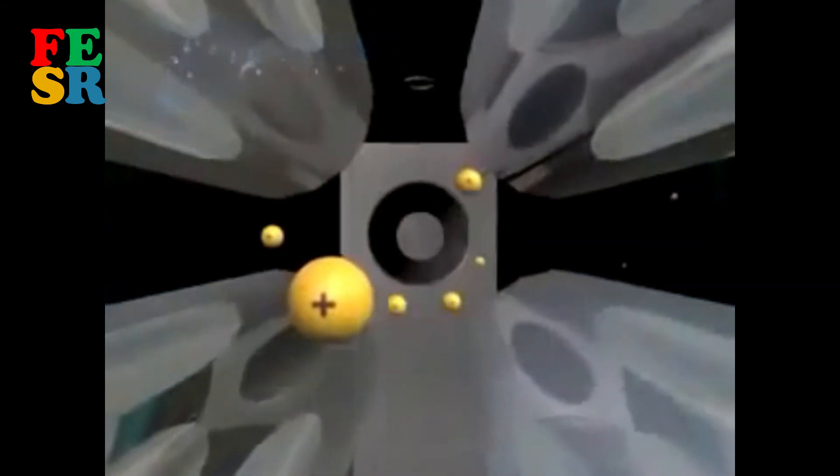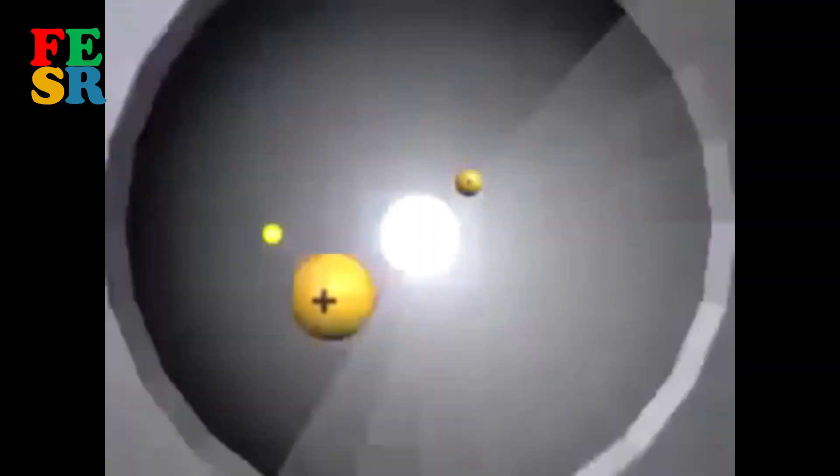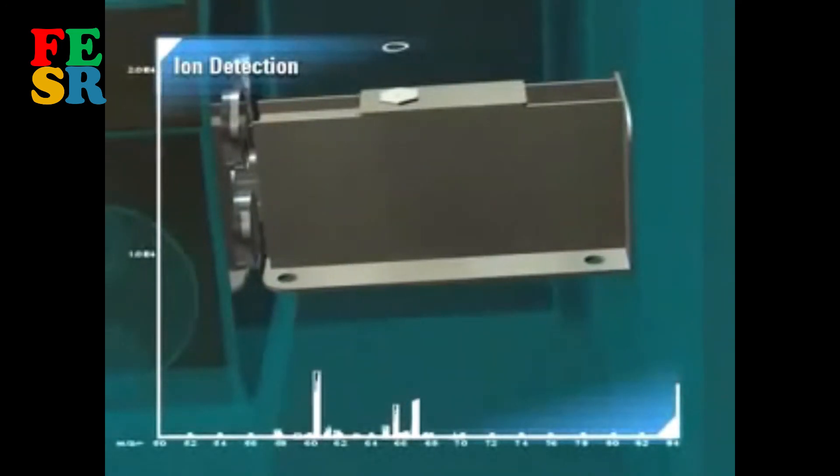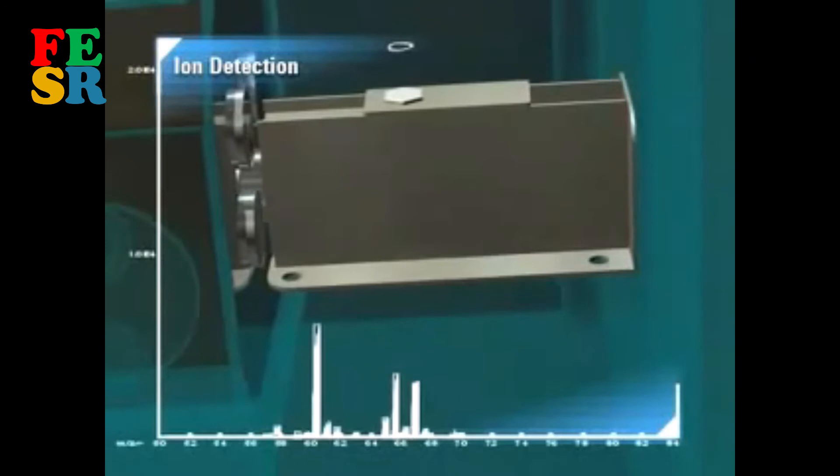Ions strike the detector and the resulting electronic signals are processed by the detector electronics and stored in a multi-channel scaler, creating a mass spectrum where intensity at a given mass is proportional to concentration of the isotope at that mass.